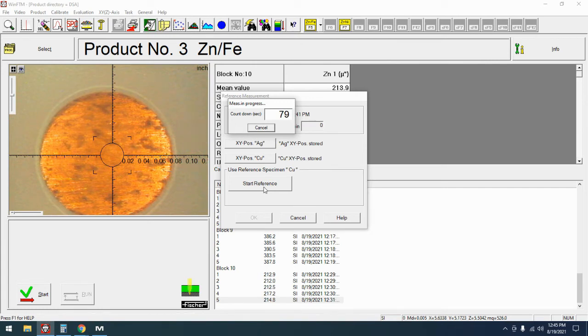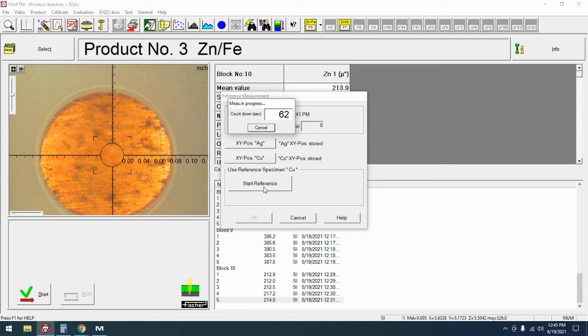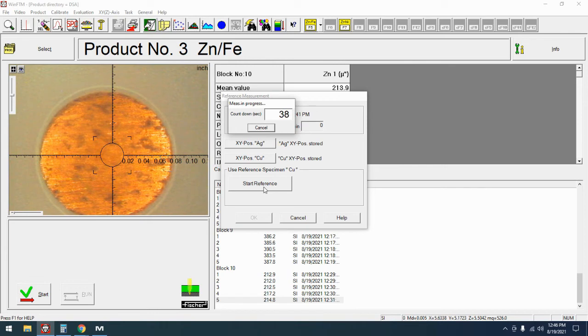The only time that you really want to worry is if you get an error or if when you're doing the automated you never move over to the copper. Now if it never asked for copper that's a problem and by never I mean within the next five to ten minutes it should do that.